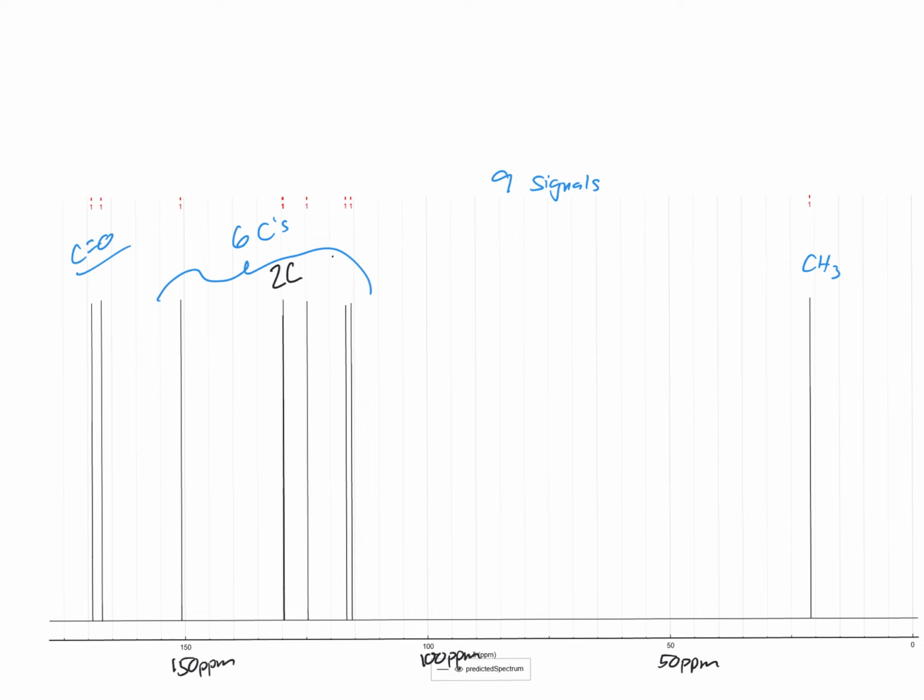And if we count our chemical shifts properly, we get 160. So basically 167, 169 are the chemical shifts here. And if you read from the table in your textbook, the carbon 13 signals table, we can recognize that these carbonyls will not be aldehydes and ketones because those signals appear around 200 ppm. So these are in the carboxylic acid or carboxylic acid derivative region, and we've already concluded that there was a carboxylic acid from the proton NMR data, and if you remember, we had this part structure from the proton NMR data.